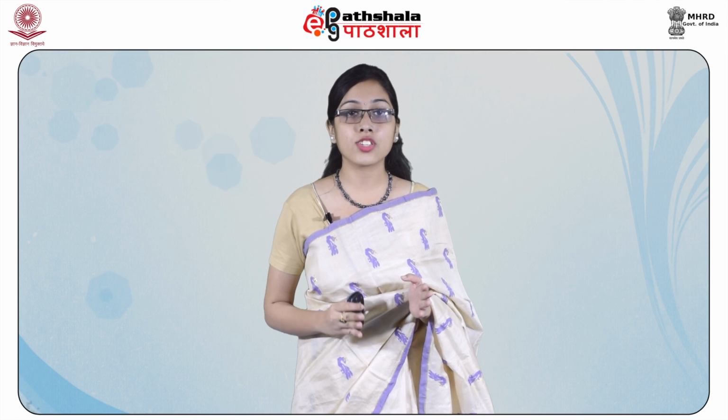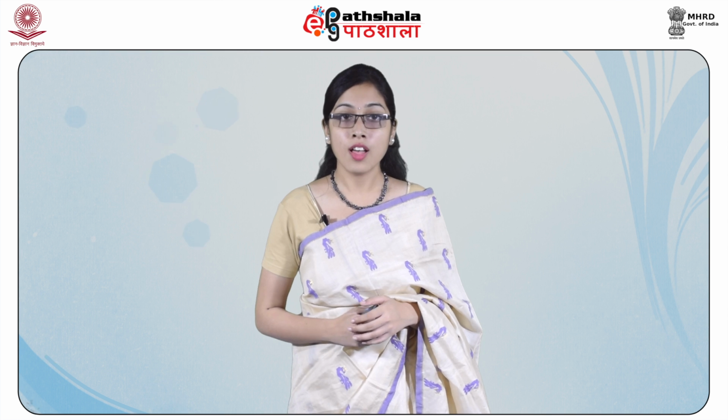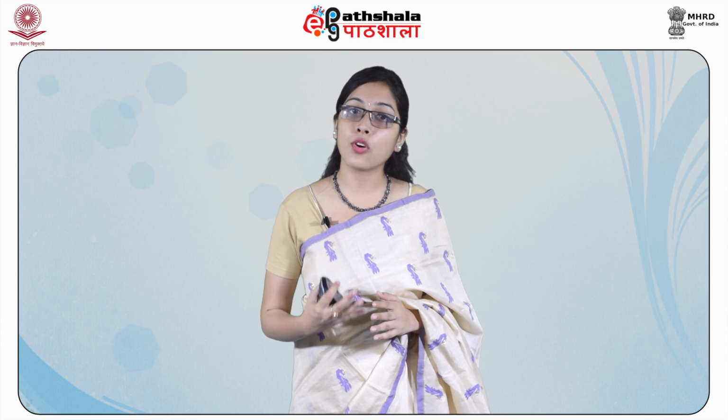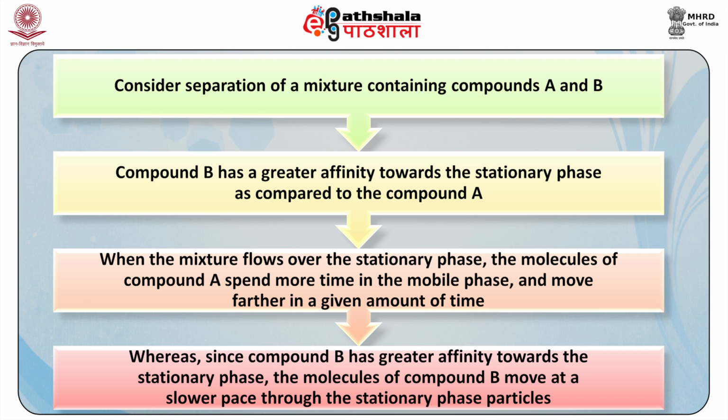The equilibrium of the molecules between the mobile and stationary phases depends upon polarity and size of the molecule, polarity of the stationary phase and polarity of the solvent. Depending upon the three factors, the components of mixtures partition differently between the mobile and the stationary phase. For example, consider separation of a mixture containing compound A and B. Compound B has a greater affinity towards the stationary phase as compared to the compound A.